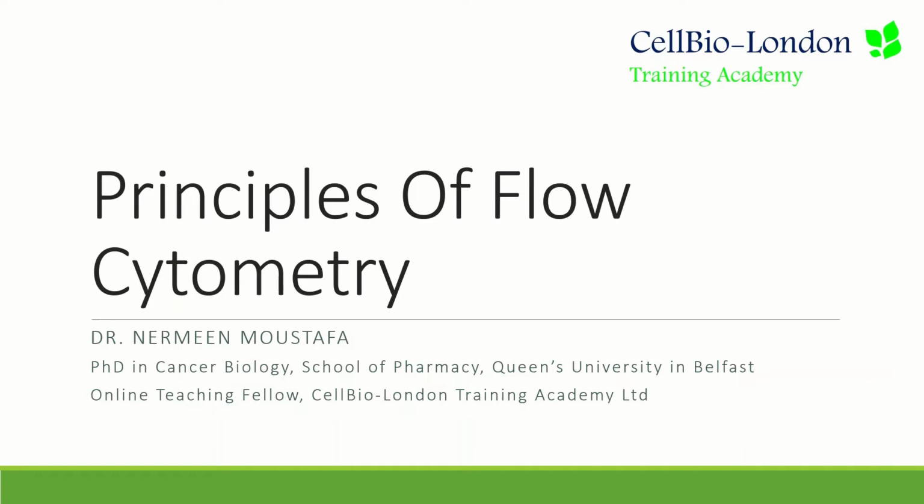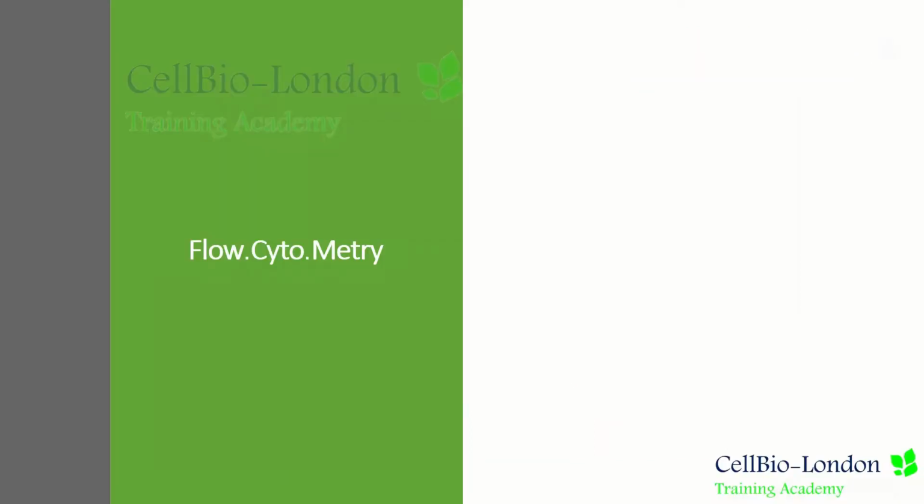This is the first lecture of this course, where I'll be talking about the principles of flow cytometry. First of all, we need to learn what the word flow cytometry means. Flow cytometry is composed of three parts. Flow, which refers to a liquid or gas or even electricity that moves steadily and continuously in a current or stream. And the word cyto means cell, and this is actually a prefix. And metry is a suffix, which comes from the Greek word metria, which means measurer.